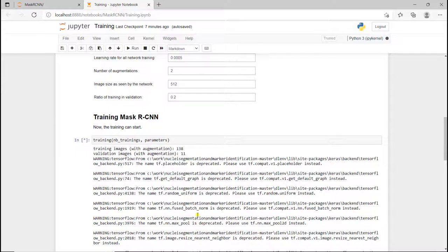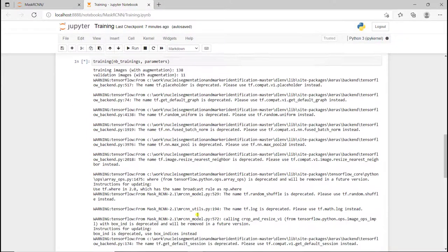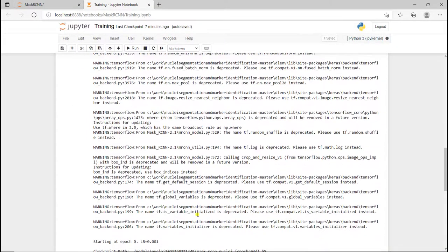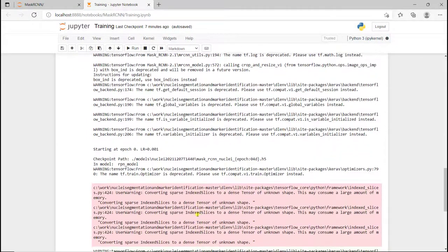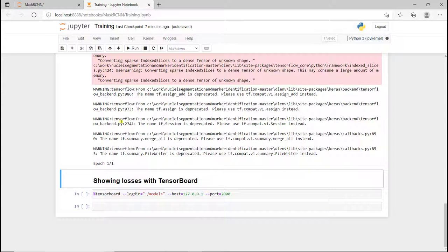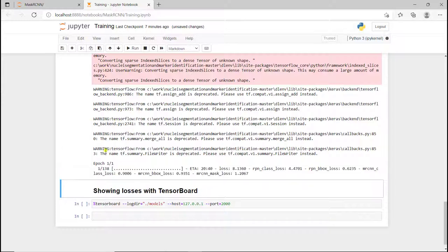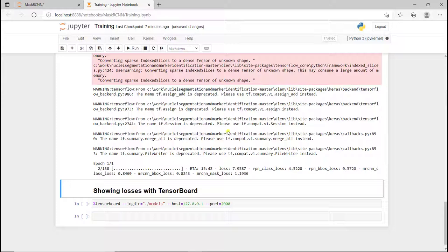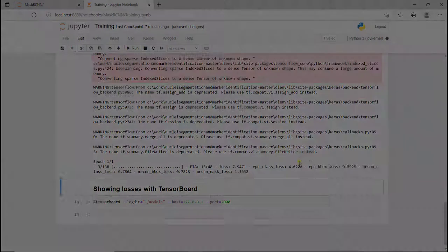Data augmentation is really important with Mask R-CNN, even though here it's definitely not enough. Now I'm starting the first epoch for the heads only, and then it will do the 3 next epochs for the entire network. I'm just going to speed up the video for the training.